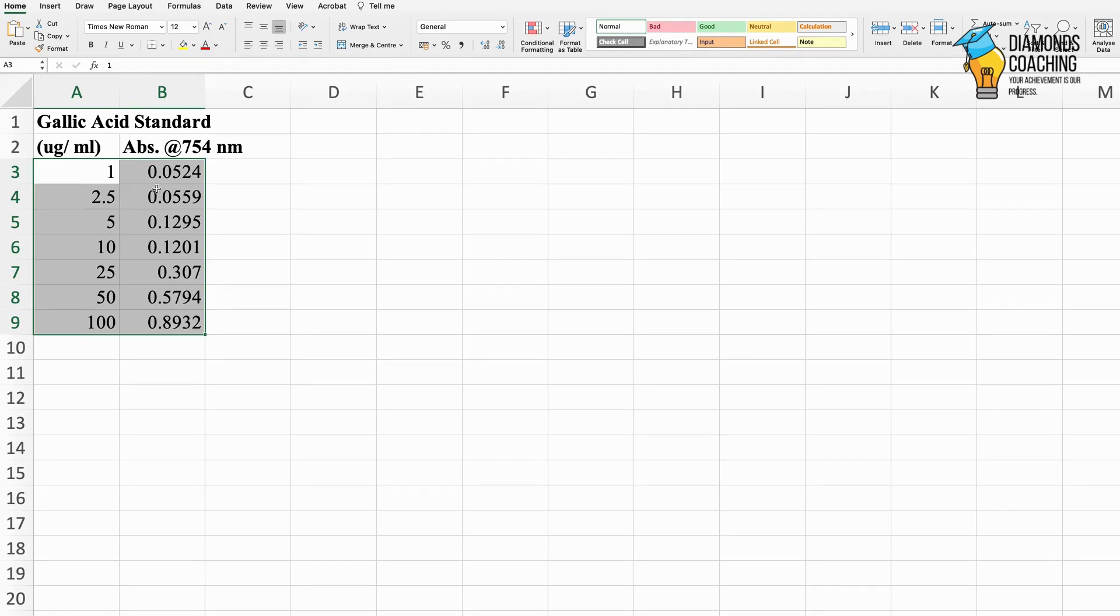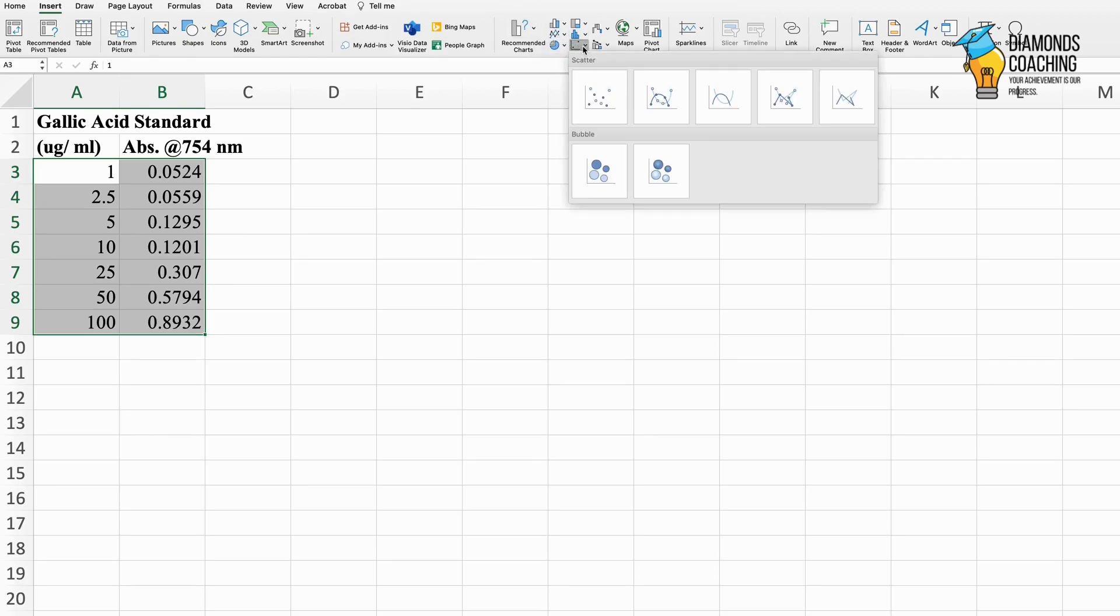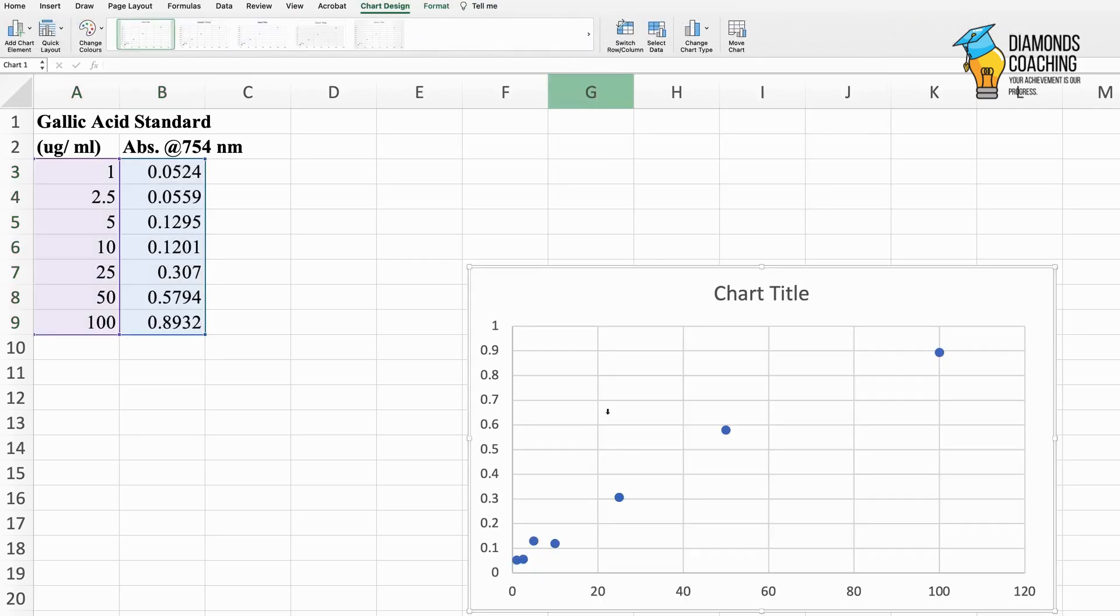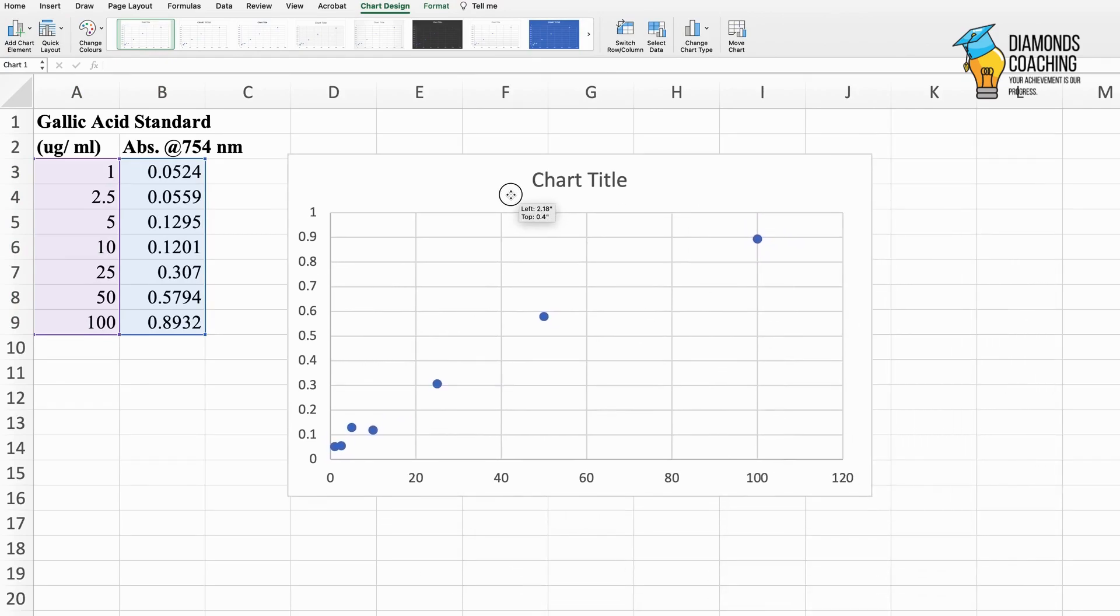I'll select this data and then go to the Insert option on the ribbon above and insert a chart. You can see the option for recommended charts, but I will go to the scatter plot XY scatter and select the first option. Here you can see my standard graph.